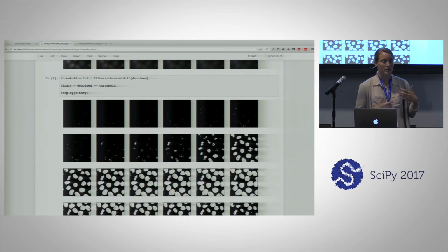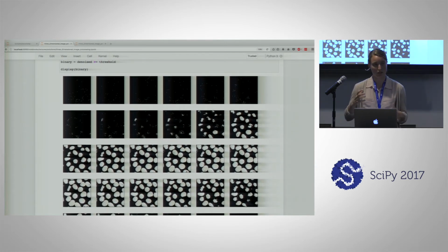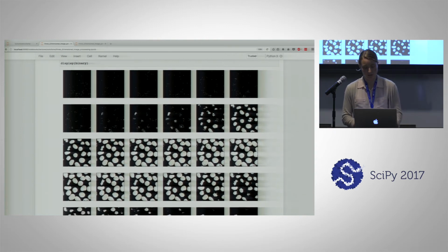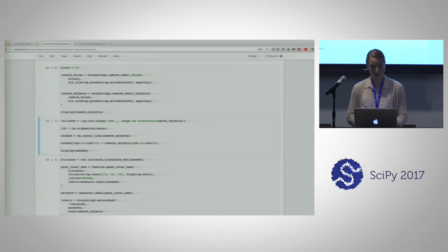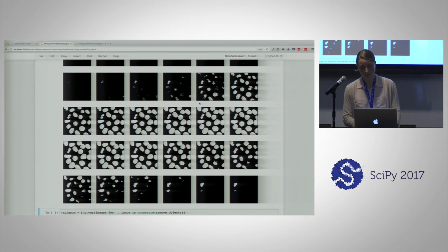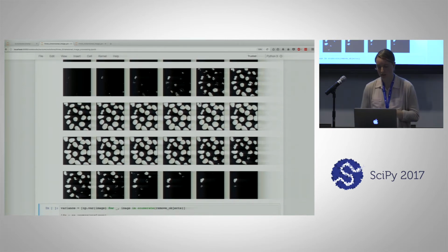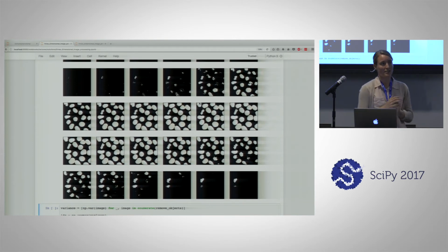So I scaled the Lee's threshold by 0.9. So we get more complete cells throughout the planes at the expense of generating maybe a little more noise that still isn't too hard to clean up with remove small holes and remove small objects, which I've combined into this step, still using that box with a width of 20. The image largely appears to look the same. This guy here that looks kind of like an S is a little more connected than before.